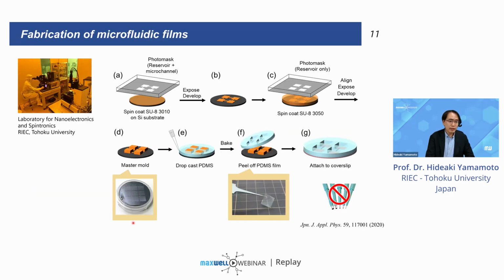There are multiple methods for patterning neuronal networks, but the most popular approach now is to use what's called microfluidic devices made with PDMS. We fabricate our own devices using the clean room facility at our institute. The fabrication starts with the fabrication of the master mold.